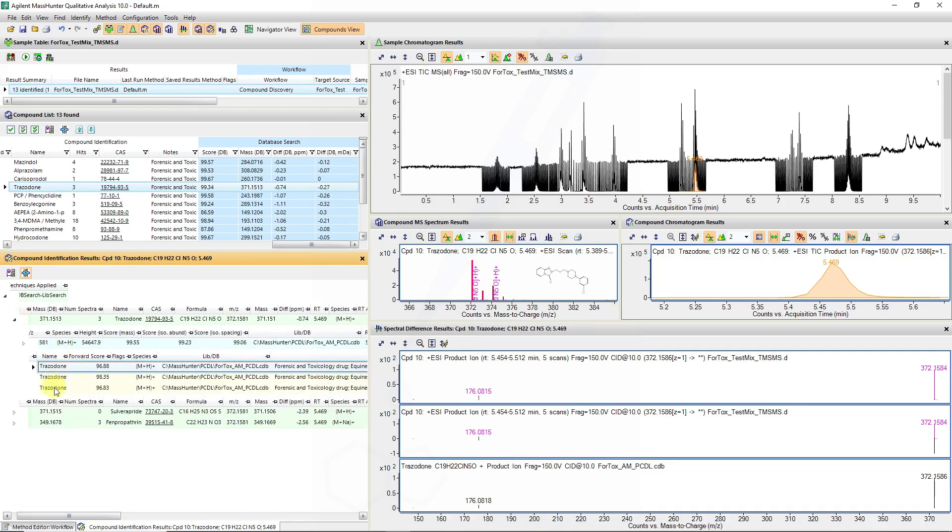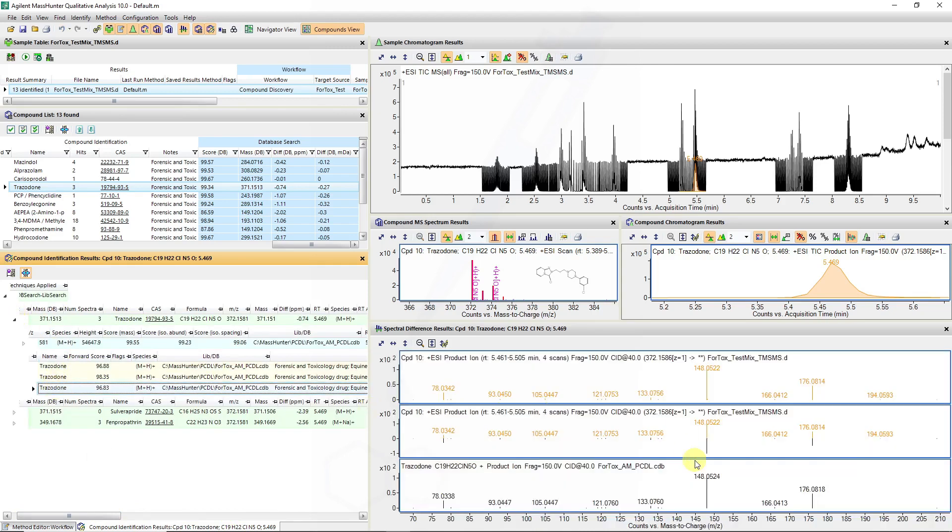We can then again look at our difference plots and see that some of the fragment ions correlate to that of the library entry.